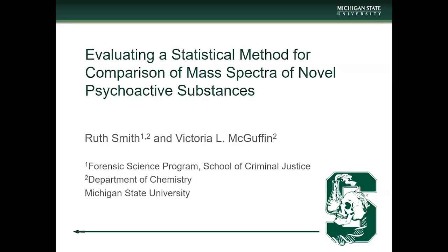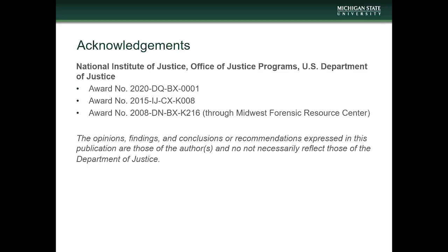Good afternoon, everyone, and thank you for joining the webinar this afternoon. Today I'm going to spend some time talking about a method that we've developed in our lab that allows the statistical comparison of two mass spectra. In theory, this method could be applied to any two mass spectra, but in the last several years, we've really focused on applying it for the association and discrimination of novel psychoactive substances, with real focus on distinguishing structural and positional isomers.